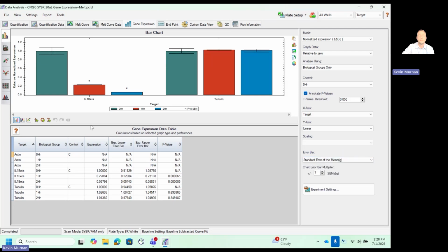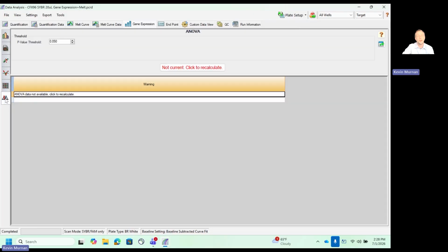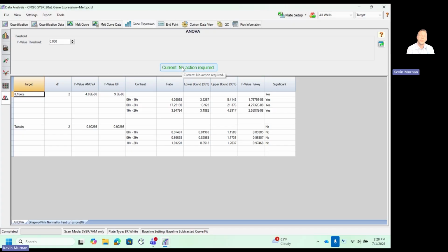It looks pretty good. Not just that, we have our clustergrams, scatter plots, volcano plots, heat maps, and even ANOVA. We can see the difference between various time points on this particular qPCR data file. And not just that, we get our p-value Tukey.